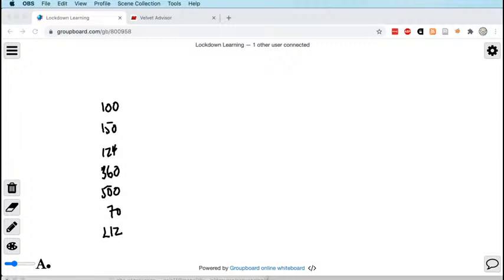So there are a few things that we need to do in order to be able to calculate that. The first thing that we need to do is figure out the total size of the assembly. So we need to add all of these contigs up. So we have 6, 8, 14, 15, 16, 21, and then 2, 7, 10, 11, 12, 13, 15. Okay, 1,516. That's how big our total assembly is.